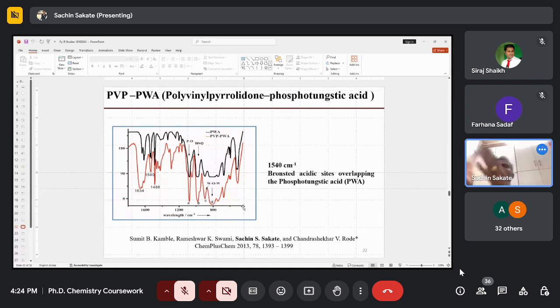These values we have copied from the instrument. These values are plotted into the Origin software, where you can have the very fantastic bands seen. You can decorate your spectra, you can label your spectra, you can use your own format, you can highlight the material by using different colors. So all this is done by using the Origin software, or you can do it in the Excel file also. That is also possible, but Origin is better than the Excel software.